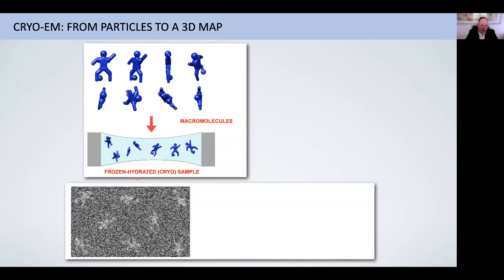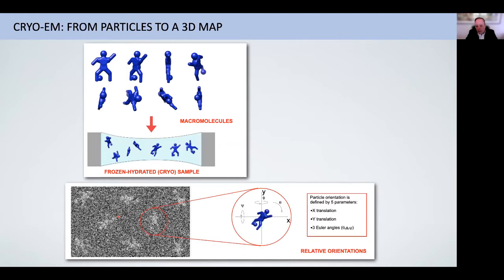The microscope then generates low signal-to-noise images of those macromolecules. The reason the images are low signal to noise is because even after preservation, cryo-EM results in radiation damage to biological specimens. However, those limitations can be overcome through computational analysis.